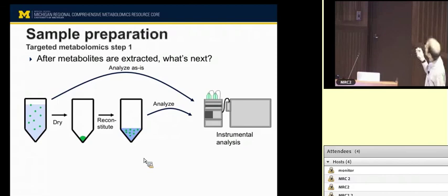Okay, cool. So when you're trying to figure out what's going to go on in an experiment, you have a treatment and a control. You have some sort of a manipulation that you're doing, and you want to understand what might be going on in metabolism, but you don't know exactly what pathway might be affected. Untargeted would be a good way to go. Untargeted tends to measure more compounds than targeted metabolomics.